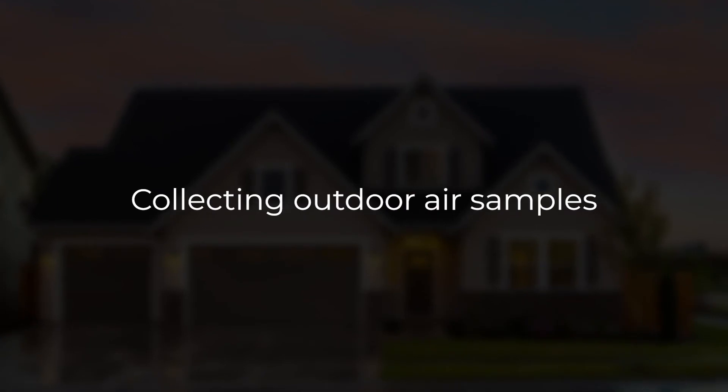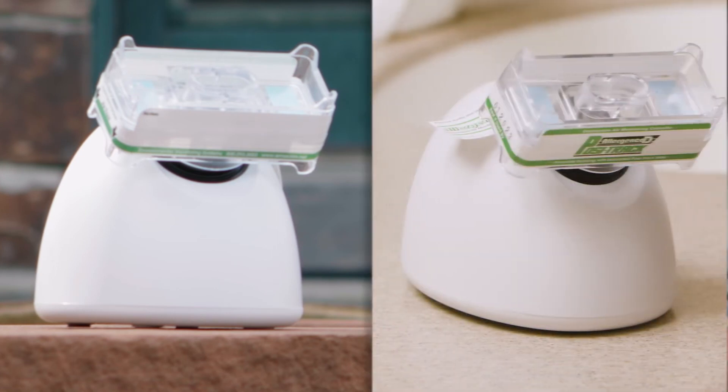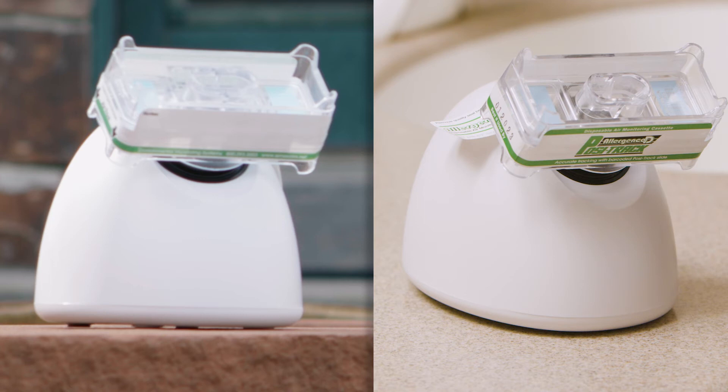Remember, indoor air sampling should test a minimum of two indoor locations. An essential element of any mold test is the outdoor air sample. It is necessary to collect an outdoor air sample so that we can compare the amount of spores found inside the home with the amount found outside. We use this comparison to find out if any spores found inside the home are naturally occurring from the outside environment or if the mold is growing inside the home. Without an outdoor air sample, Sporesight will not be able to issue a report for your project.